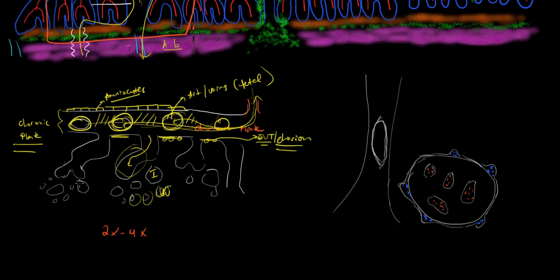You'll see a few of them here. And so what you see is these clusters and clumps of these lobular shapes that represent various tangents of the branching structure. So this will be a primary villus, and then in this section you might catch it bifurcating. Here you might catch another one bifurcating. And then you'll catch some of what it's given rise to distally, some intermediate villi, and then you'll see some terminal villi, and the gas exchange occurs here. And that'll be at around 2x and 4x.